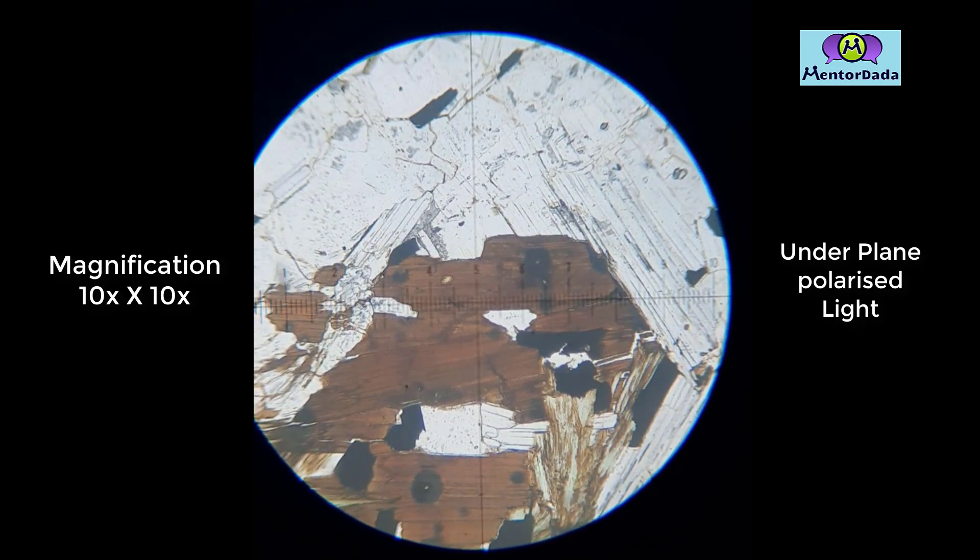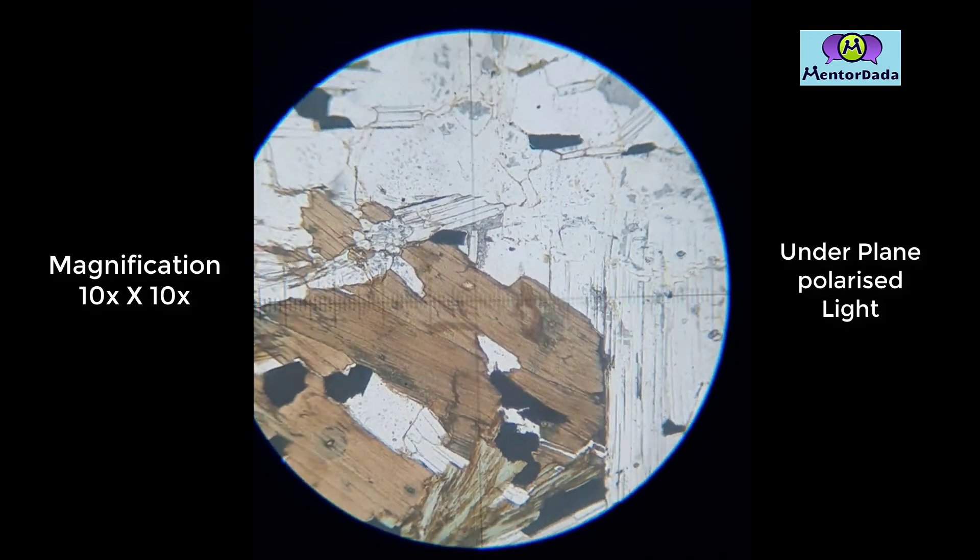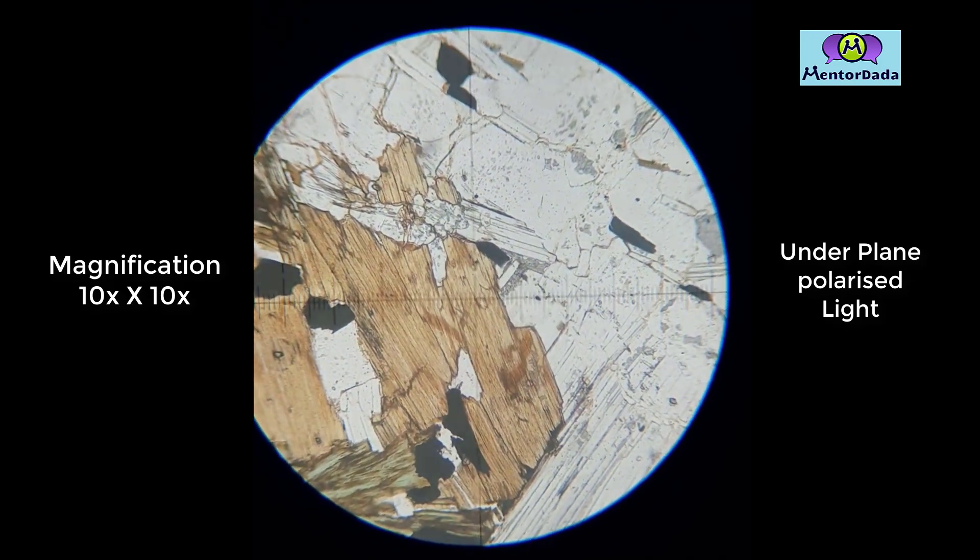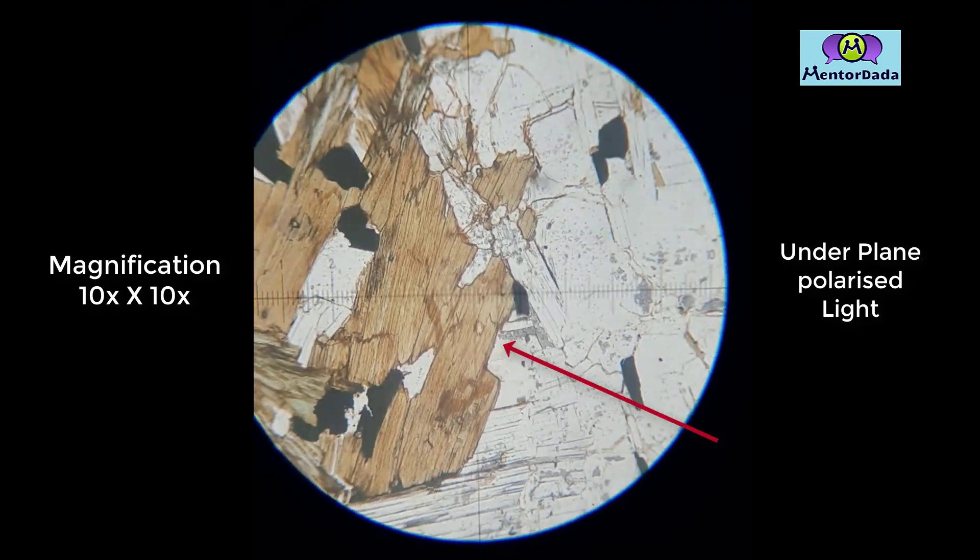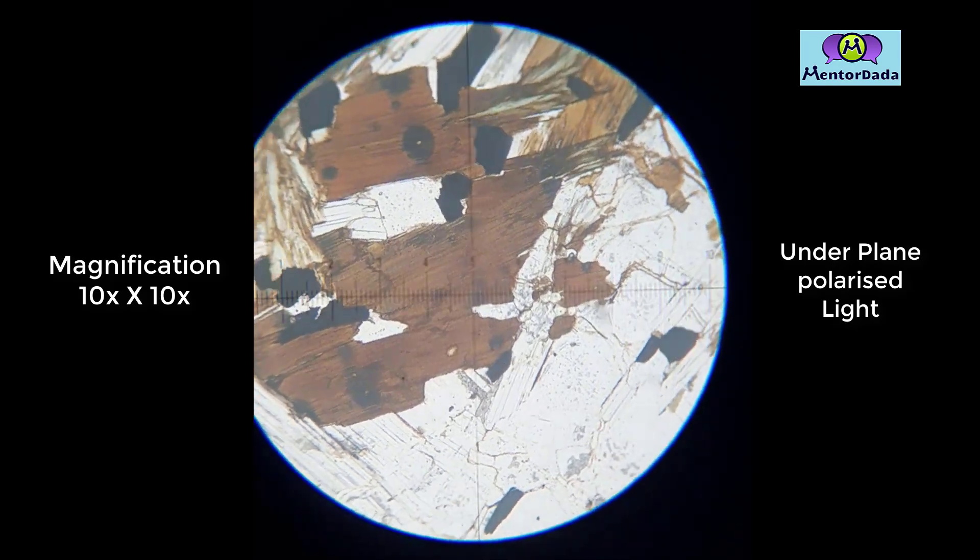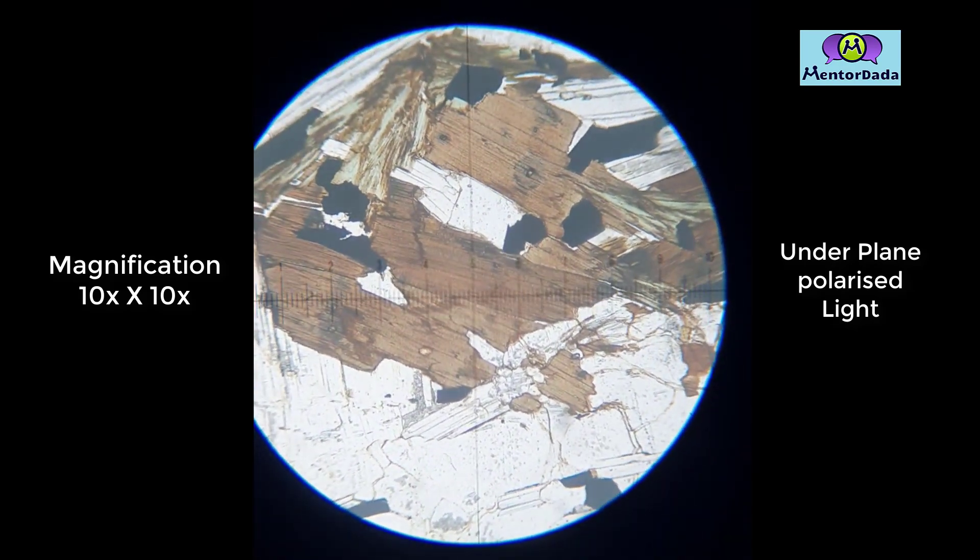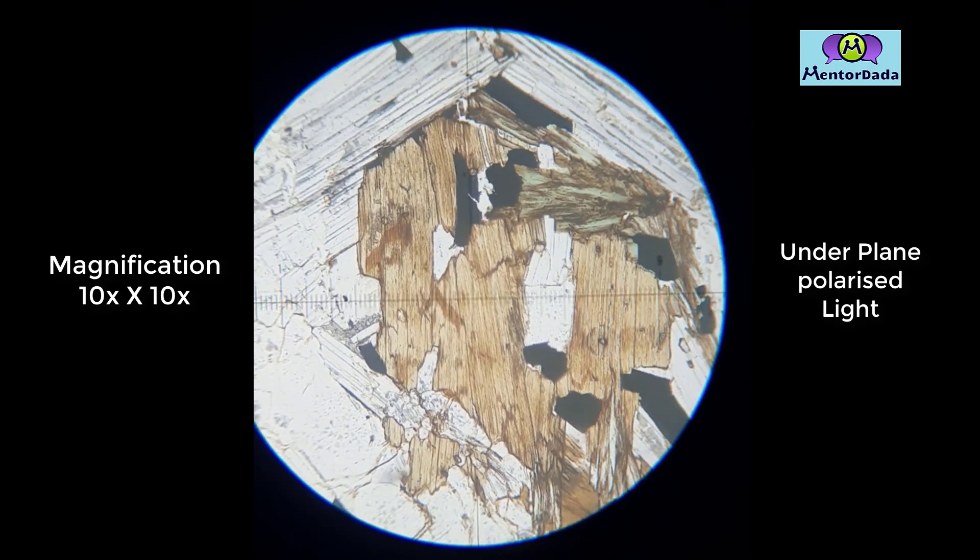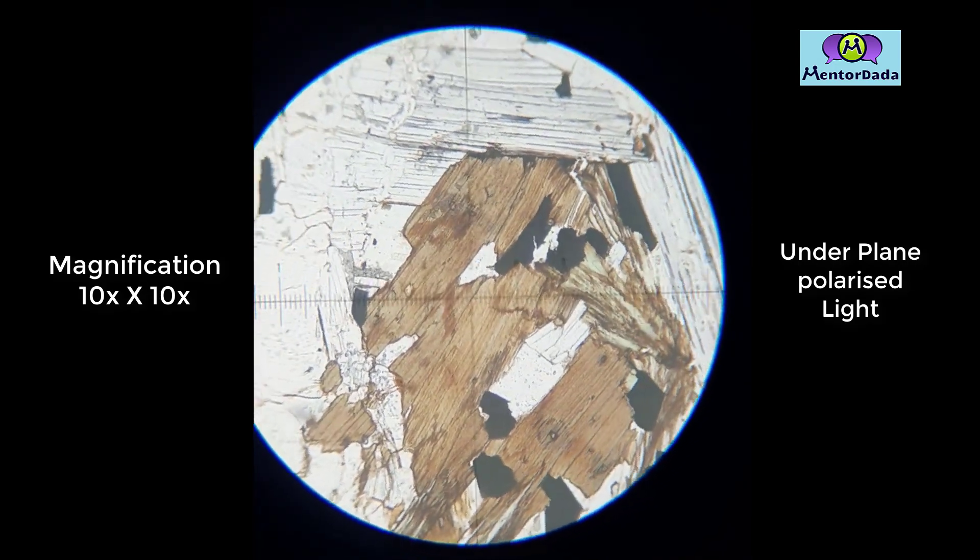After observation, we can say that the relief is moderate, as the outline is moderately prominent and it has also got some rough surfaces. From here we can conclude that it is a medium RI mineral.